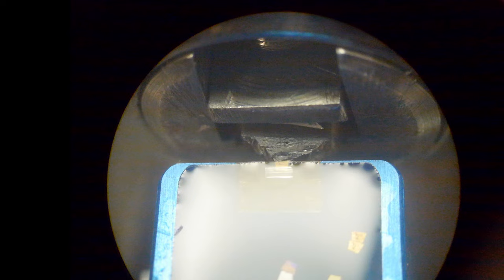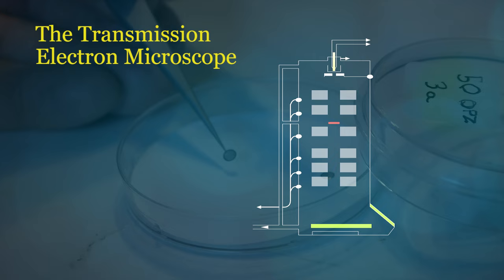The grid is lowered into the water bath and the sections maneuvered onto it. The grids with the sections on them are then dried on filter paper.